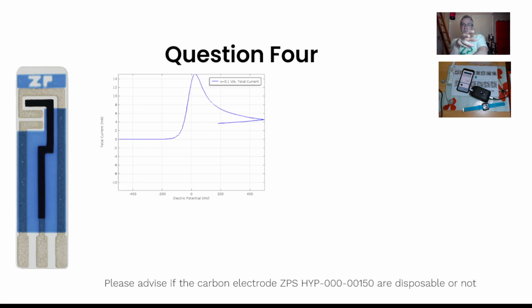So there's been a lot of conversation this evening about ferricyanide. If you do simple experiments like ferricyanide, yeah, you can reuse the screen printed electrodes. So I can take one of these, you can put a drop on there, you can actually reuse it. One thing I will say, you'll have people who've bent them and twisted them and broken them. At that point they're not reusable. So you've got to be a little bit careful with that, especially if people are using them with scientists who are a little bit rough with things, let's say. So that would be one problem.